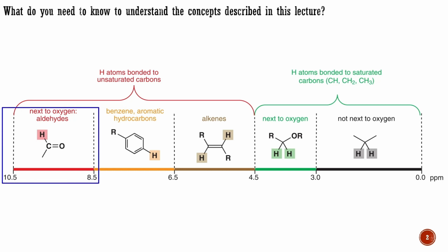In this lecture, we will specifically focus on the proton NMR of hydrogens bound to unsaturated carbons next to oxygen. Additionally, you will become familiar with the typical signals for protons connected to a heteroatom.